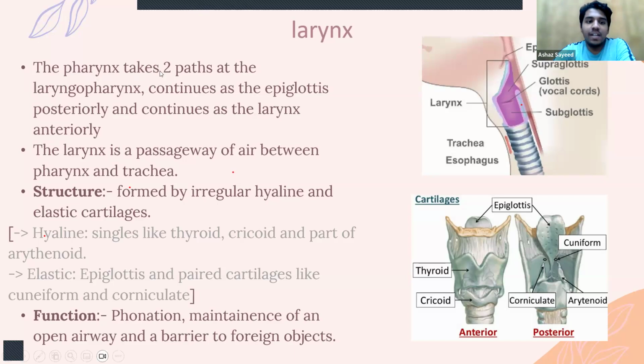Towards your back you have your epiglottis, and more towards your front you have your larynx. See the image over here.